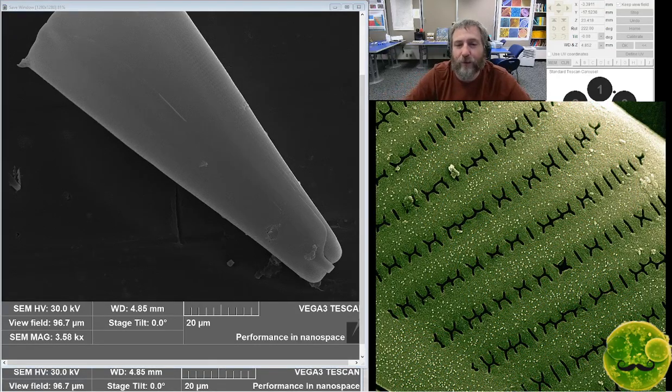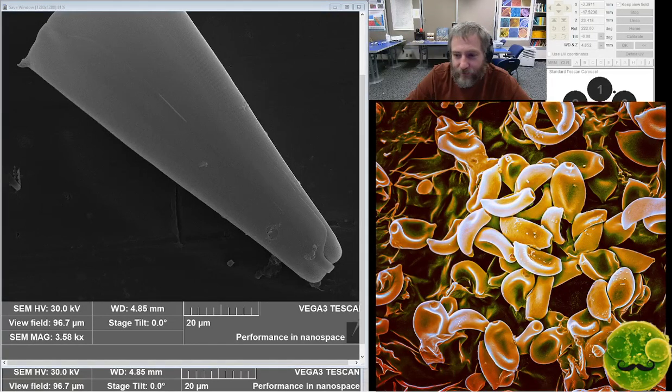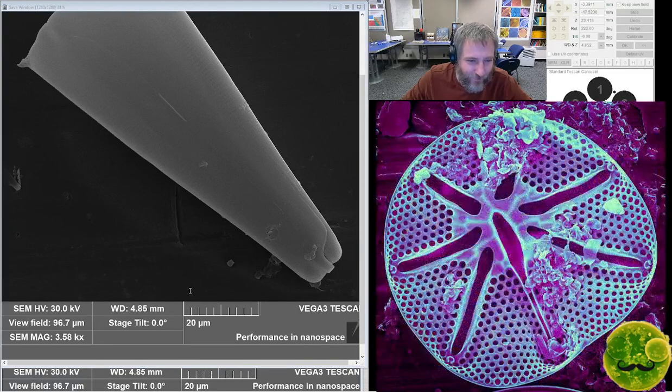But you can create a 3D model from SEM images or from anything where you have enough pictures of it. Each of those pictures took me 5 minutes to collect, and then there's 75 of them. It's a lot faster to get a 3D model from atomic force. So that's generally what it is. Again, you're asking me about something pretty far outside of what I do, but I've used an atomic force microscope. Well, I've watched it used, let me put it that way.